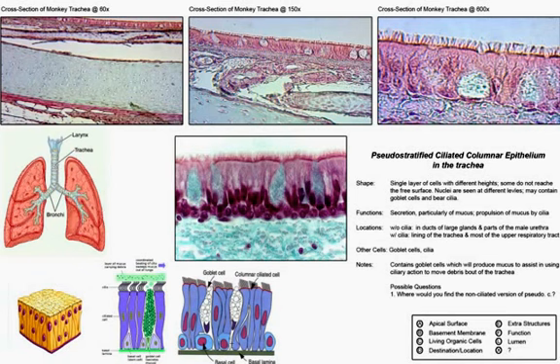This type of epithelia would be pseudostratified because the false appearance of stratification, or the double layer of nuclei, is the result of the placement of the numerous goblet cells, the unicellular glands producing mucus, so that the air that we're breathing can be cleansed and rid of debris and any dust particles that would need to be eliminated. The cilia that's present here all throughout is visible here.